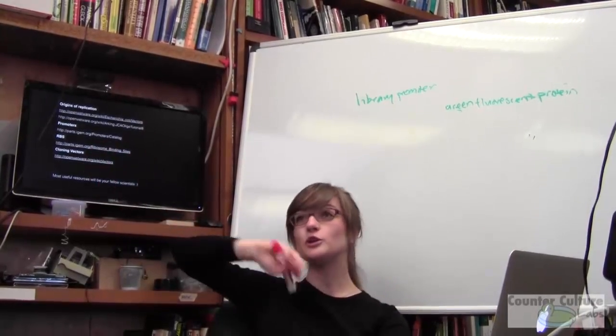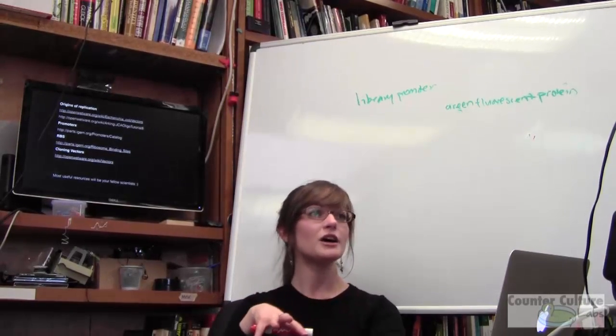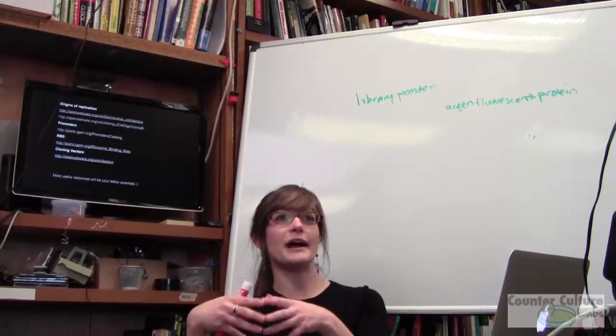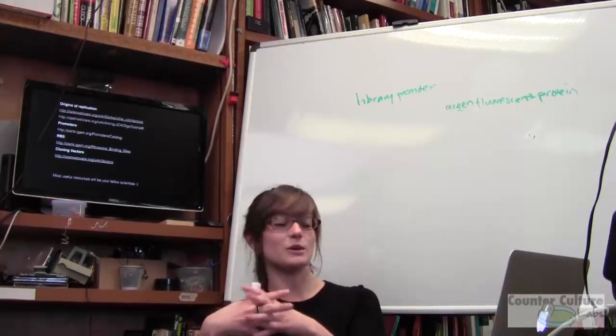Because when you start cloning, you're probably going to be working with vectors like pUC vectors, these very standard vectors that have high origins of replication, high copy number, which is fine and it's great for just learning how to clone. But then when you actually go to wanting to express something, there are other things that you may want to be able to manipulate.